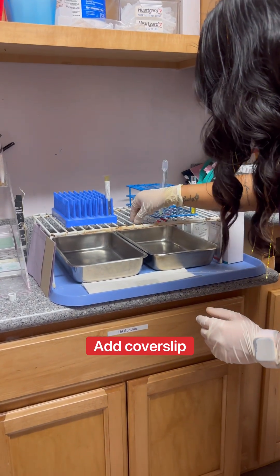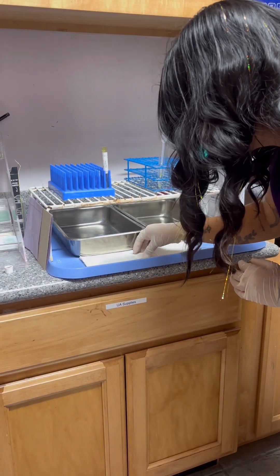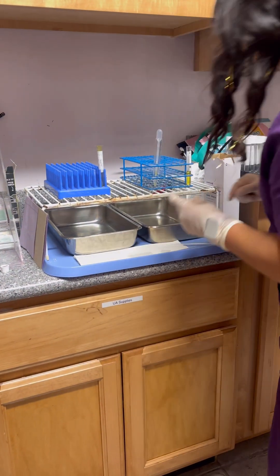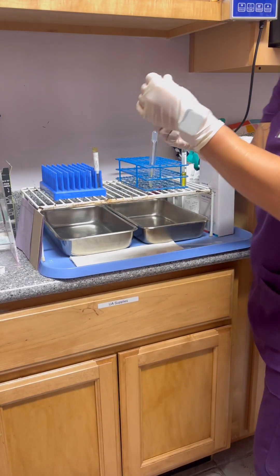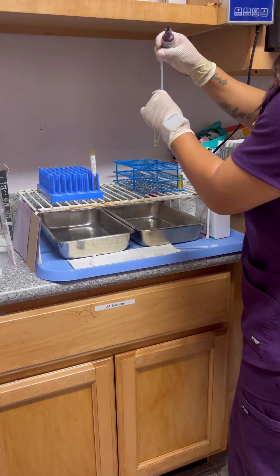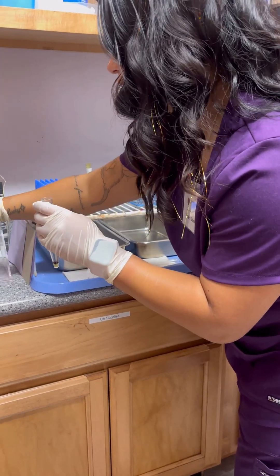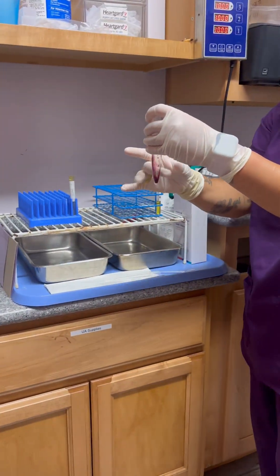Put one drop in there, then cover it with a cover slip. Then put a second one. I'm going to use the same sediment stain. I'm going to do one drop.